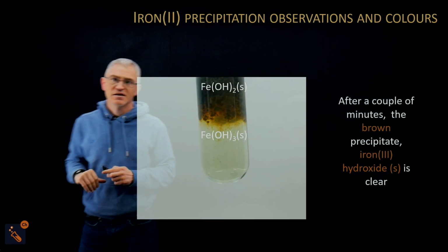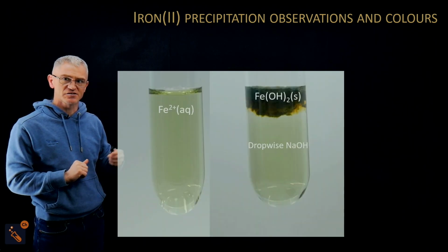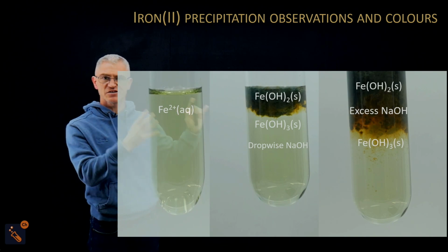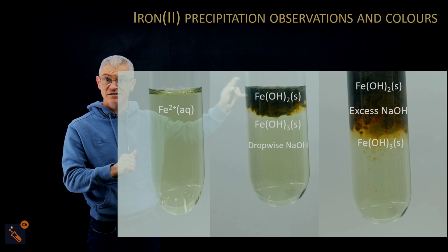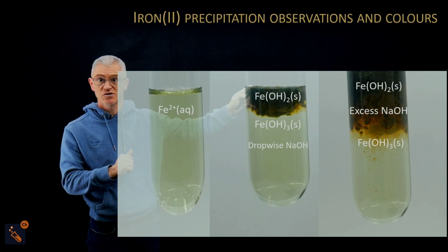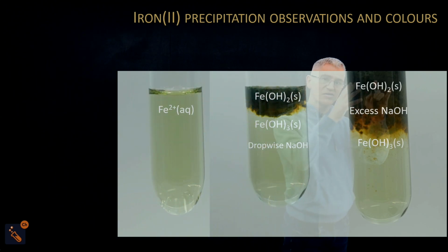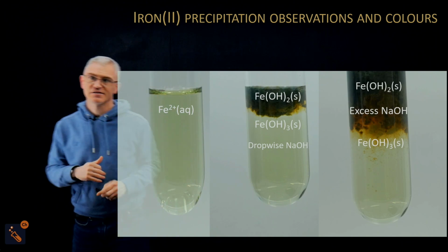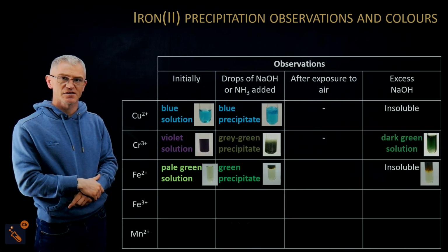Okay, now, if you move on, let's have a look at these 3 things. We've got iron 2, which then reacts with sodium hydroxide dropwise. You get iron 2 and a little bit of iron 3 on the edge. The answer in the exam is iron, this one, the top one. Okay. Then you go from here and you get iron 2 when you've added excess, and again you'll get a little bit of this iron 3, this brown. That's what that brown colour is. Let's put that in. Okay.